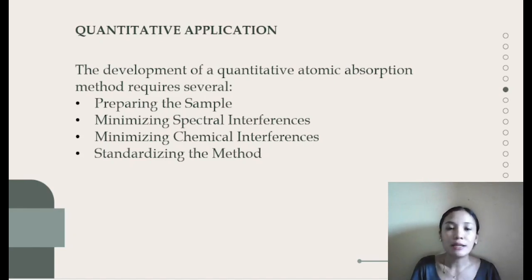After which the liquid sample will then be analyzed and undergo the chosen atomization method, depending on whether those methods are applicable or compatible to the chosen sample.